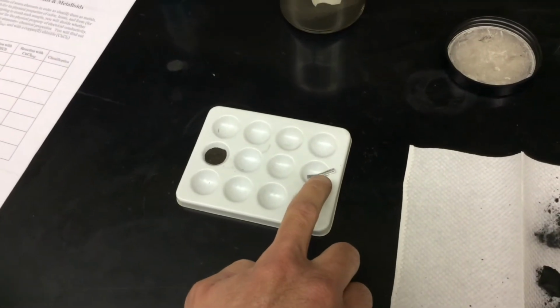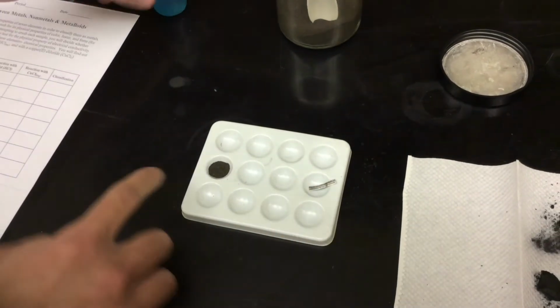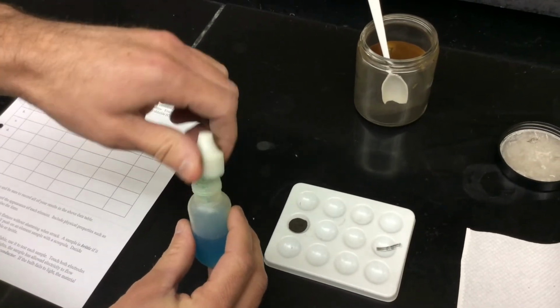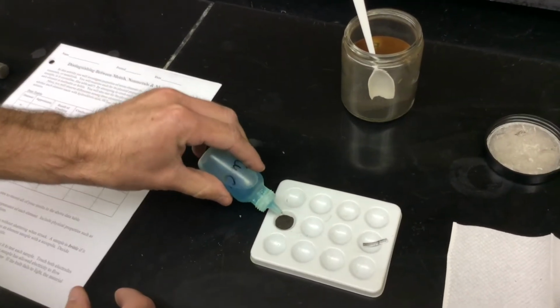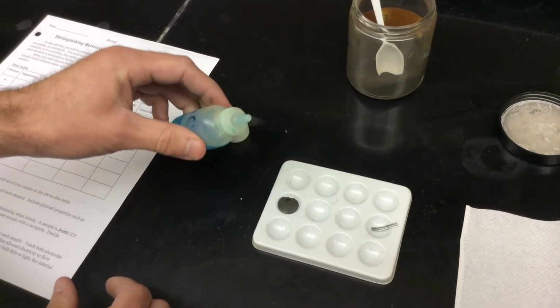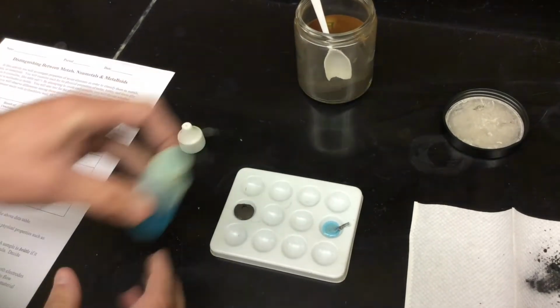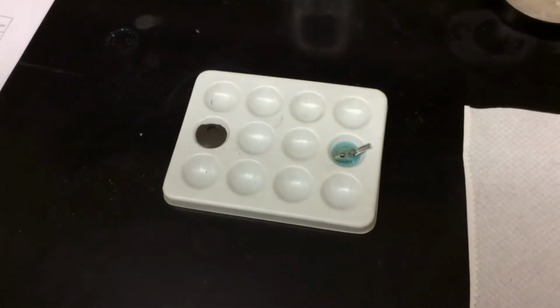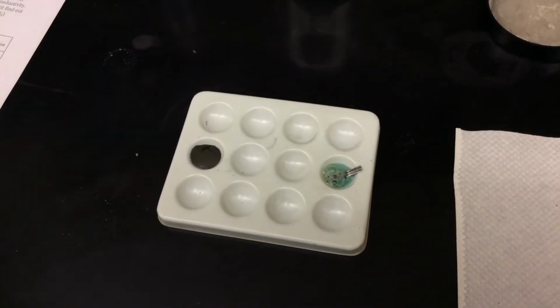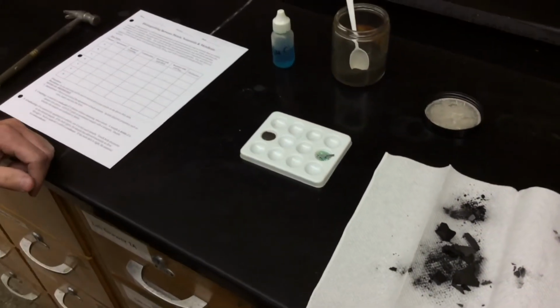And then if you have a piece of metal like this, what I think works well is if you have part of it submerged and then part of it out of the liquid. So when you have the liquid in there, and this is the copper 2 chloride, add a couple drops just to cover the solid. And then it might take a minute or 2 for that to react. And do the same thing with this one. Add a couple drops. And what I would do is leave some of it out of the liquid, so then you can compare before and after if you have to. You can use your forceps and take that out and compare the 2 halves of it.